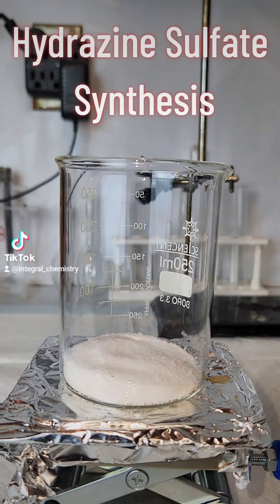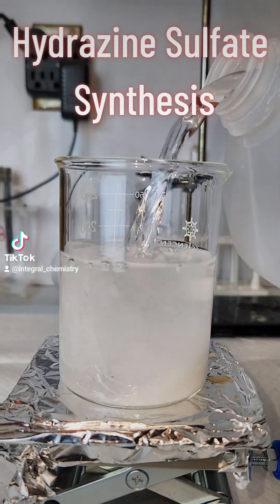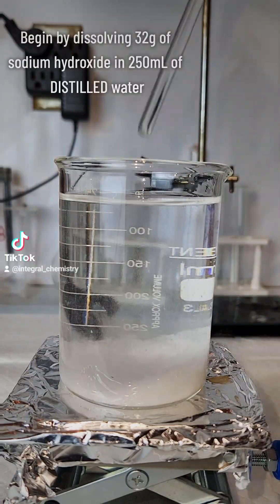I need hydrazine for a project I'm working on, and since hydrazine is so toxic, I'm going to make the much less toxic salt, hydrazine sulfate.